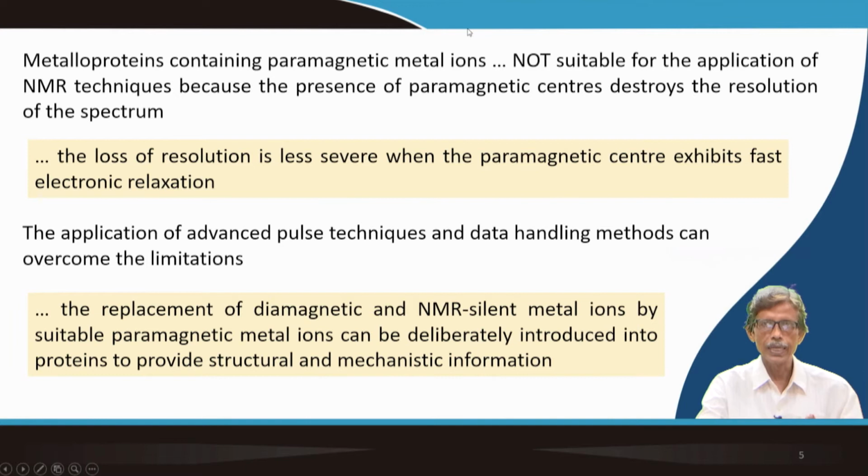So, these are basically the techniques, because we are interested to know the techniques, not the theoretical justifications or the theoretical background of all these techniques, but how to use them when you have a sample of a biomolecule containing a metal ion, diamagnetic or paramagnetic, whatever it is, and how to handle the corresponding spectrometer.